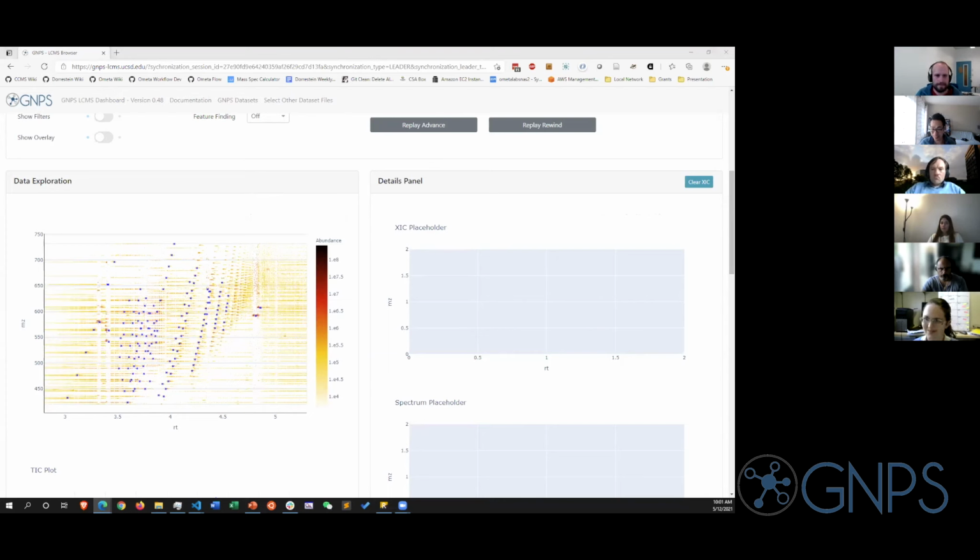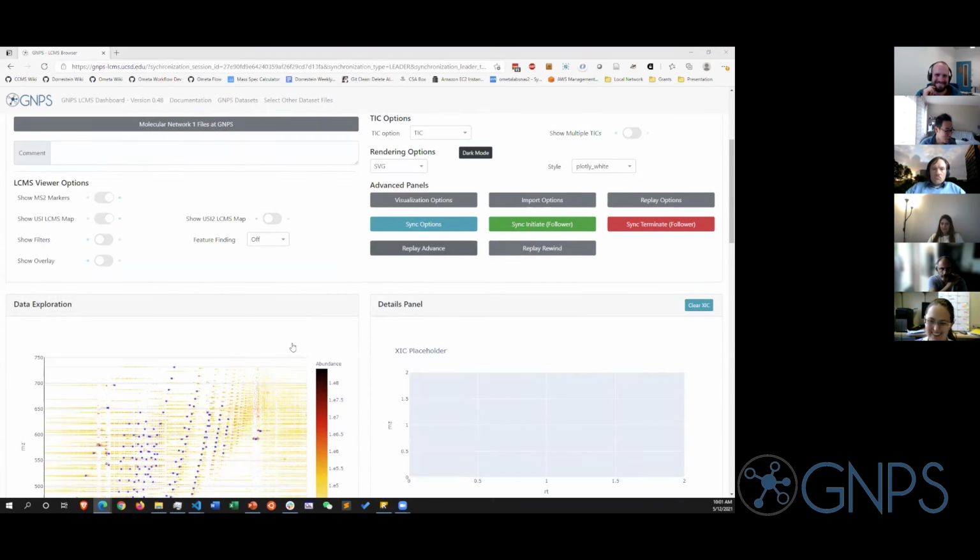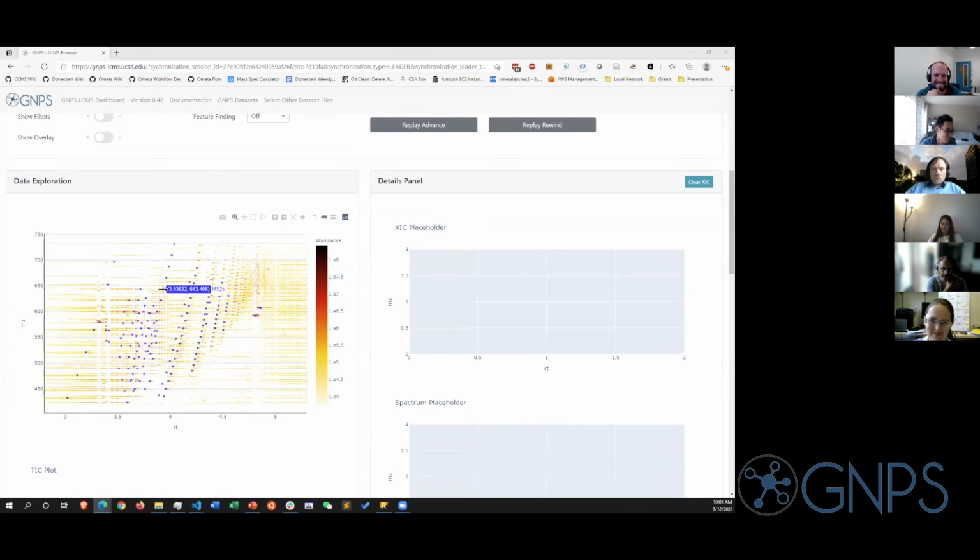It works. Okay, there I'm seeing the server and it's really chugging, but it did it. And then one of the things that you can start doing is clicking on these blue X's. So if you do something, I'll just overwrite your changes.